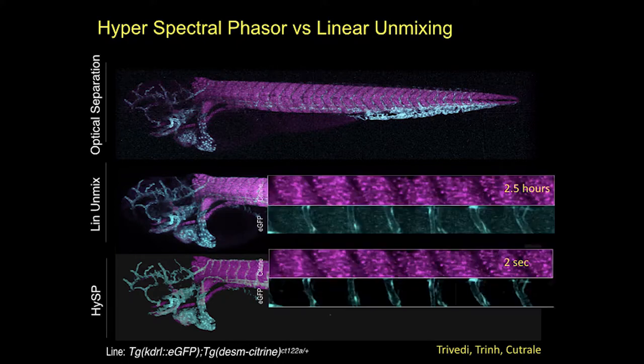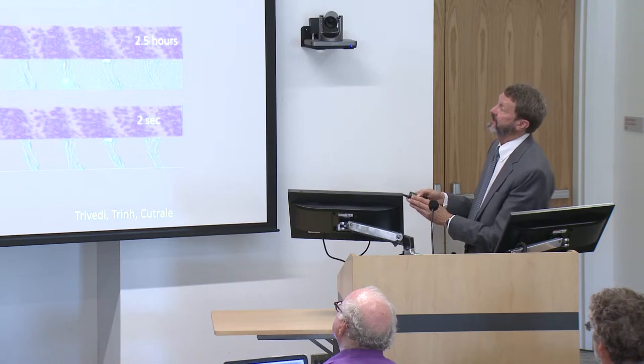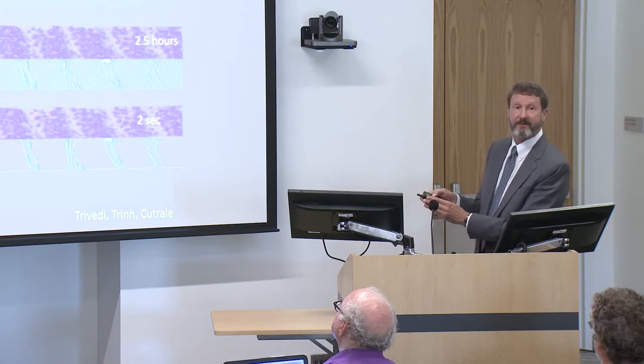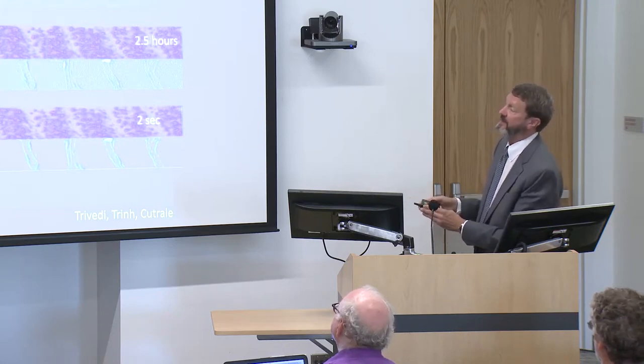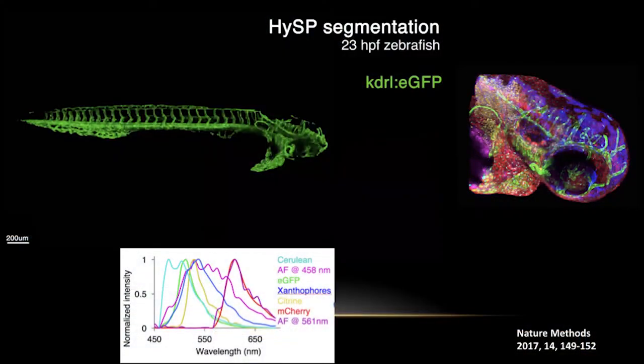So again, since these specimens can be a gigavoxel of imaging data, if I have to solve an inverse matrix problem for each of the points, what ends up happening is that it takes time and it propagates from the noisiest channel to the least noisy channel. So this blood vessel label shows up in between the blood vessels as well as in the blood vessels with the normal technique. Using the Fourier domain technique, it's dramatically faster, as fast as collecting the image, and the crosstalk disappears. So what this allows us to do is to take intravital labels like fluorescent proteins or like autofluorescent signal or structural signals and to unmix them on the fly.